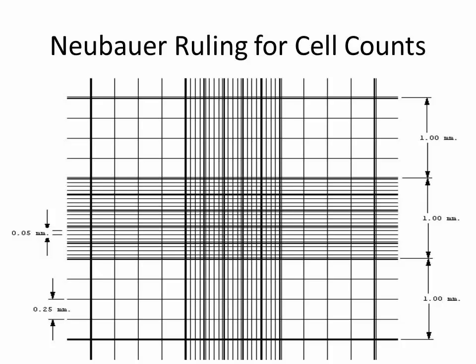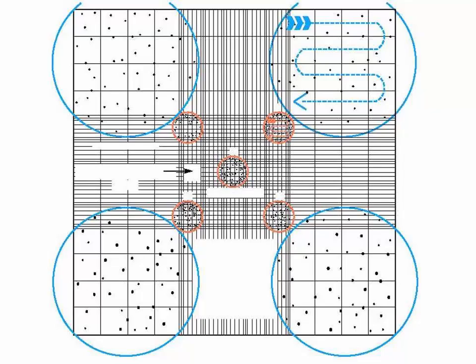And this might be how you would go about it. Choose 4, and we take the average of what's in those 4. And just be consistent, maybe start in the top left and then do this pattern down through the grids. Or the same if you were counting these grids. Keeping in mind that these will be smaller, but then you simply plug that into your equation for your back calculation. So this is how I would approach it. I would do 4 grids. Typically I like to do these, because usually when I get sent samples, there's a lot in it. I don't need to get down to the small level.